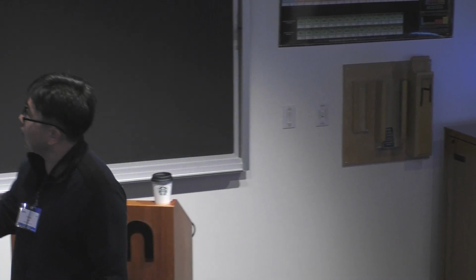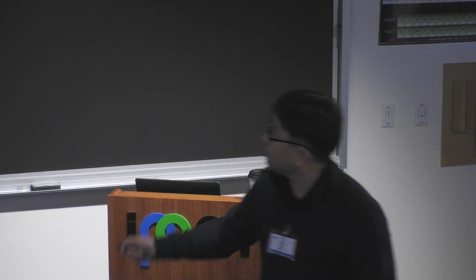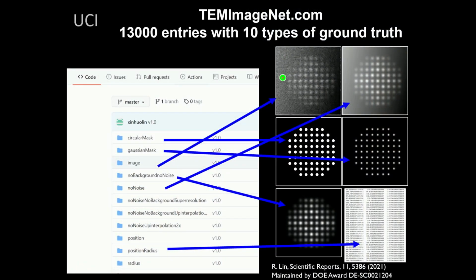Okay? All right, so let's look at this. So basically, my group has provided this TEM ImageNet project and giving you simulated images that almost look like experimental images and give you basically no noise as a ground truth.